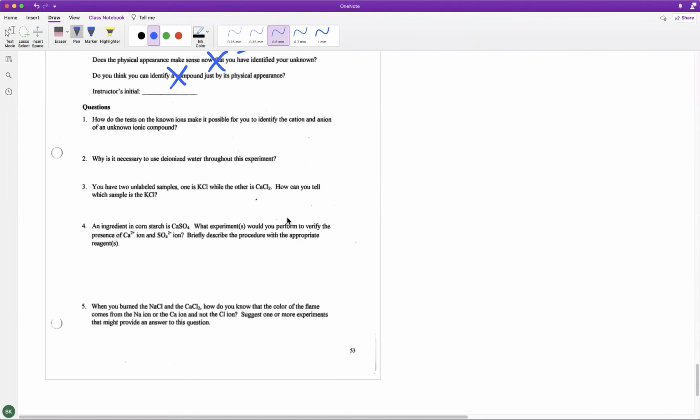All right, then a couple of other hints about the questions. In this lab, you won't see it because you're not doing the experiment, but in this lab, we always use deionized water for all of our experiments. Remember deionized water, from the first week we talked about there's a spigot in the lab that gives water. It's very clean water.